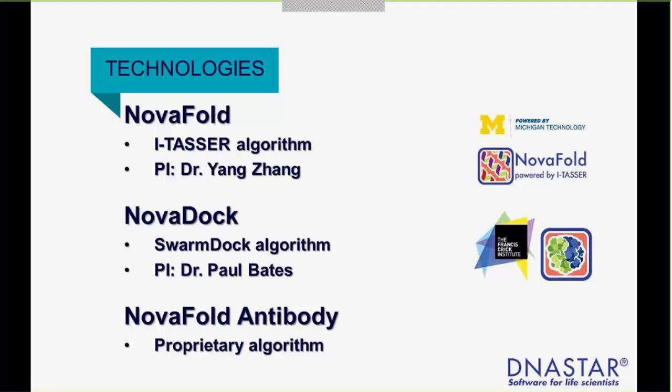The principal investigator behind that work is Dr. Paul Bates. And the NovaFold Antibody algorithm is actually a workflow that we have created here at DNASTAR. It's a homology modeling workflow for quickly assembling antibody structures.